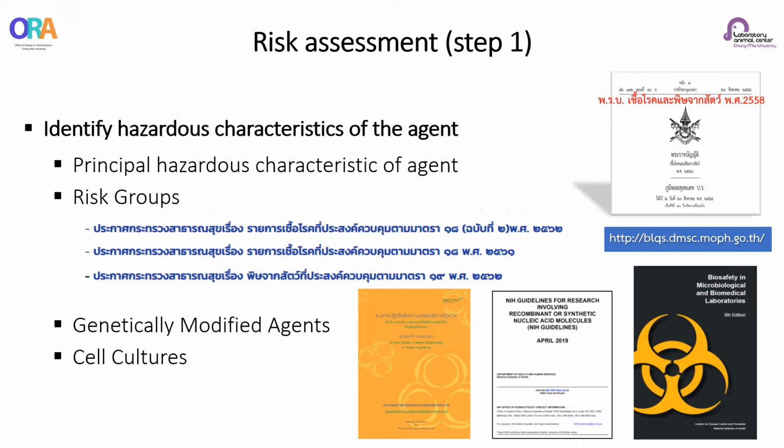It is important not to confuse this risk group with the BSL level. The agent risk group may correlate with, but does not equate to, the BSL level. Okay. The next is the genetically modified agent.